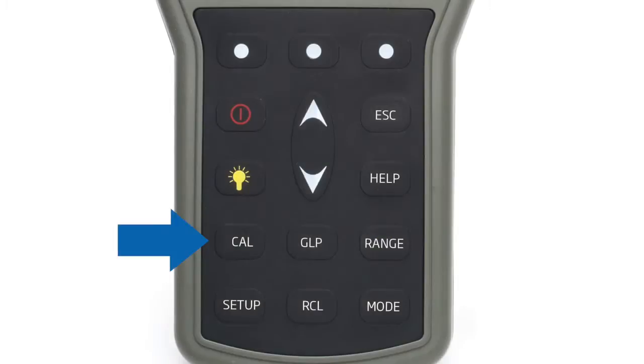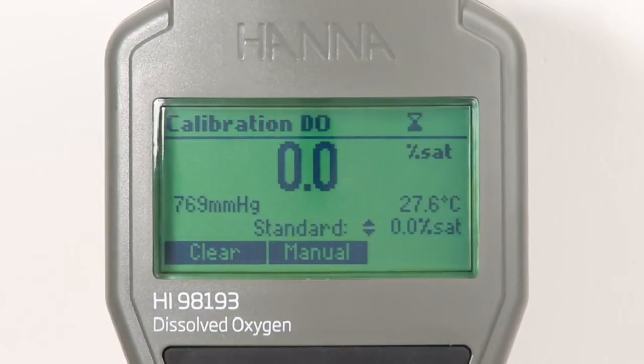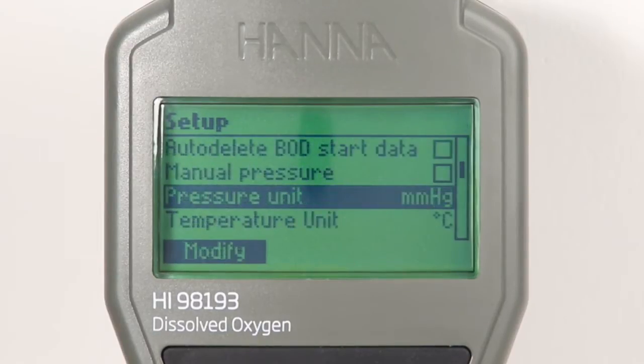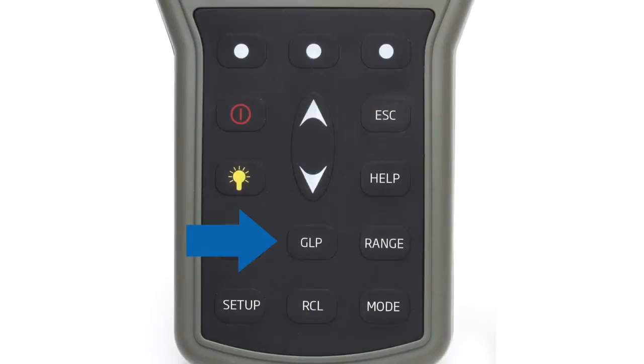Pressing the dedicated cal button allows users to enter automatic calibration. Calibration can be performed for dissolved oxygen up to two points at zero percent and one hundred percent saturation. The integrated temperature and pressure sensors may also be calibrated.